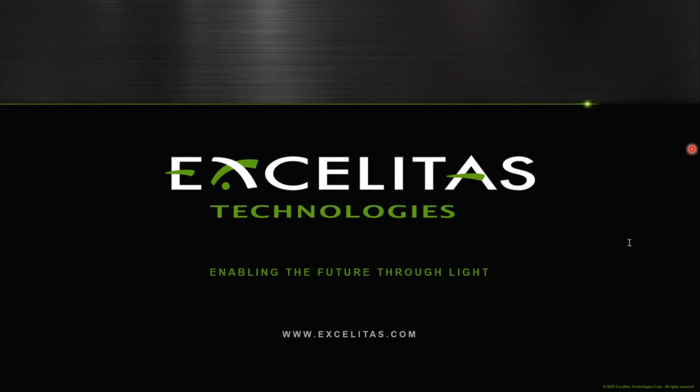What is the lifetime for LED light sources? So the LEDs themselves, people say they can go between 50,000 and 60,000. But once you integrate them into a system such as ours, again, depending on the unit, it's between 15,000 and 25,000 hours, which is a lot. And that is on time, right? Because you're turning them on and off as much as you'd like. So it's not like a lamp when it's on all the time.